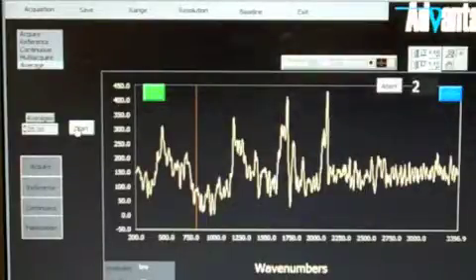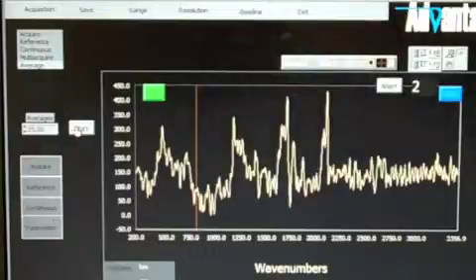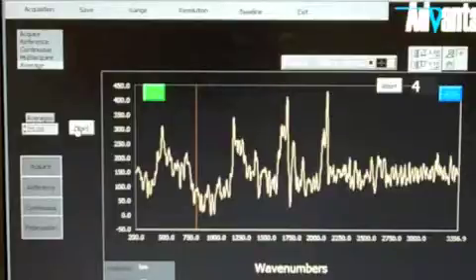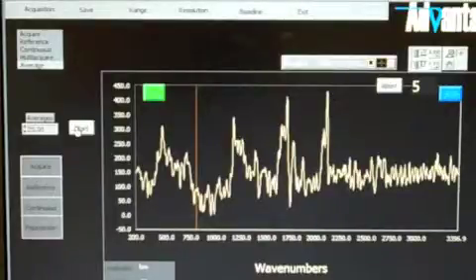This approach takes longer for the computer to process the data. However, it avoids a problem associated with long integration times. Long integration times lead to detector saturating, that is, reaching a maximum allowed count, and possible compression of peaks.